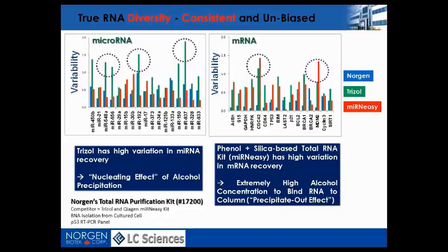The question is, is this suitable? Bear in mind that while these methods are good for certain types of samples, they still have some shortcomings, especially when dealing with samples with very low RNA inputs. One of these shortcomings, for example, is the loss of diversity, especially when extracting RNA using phenol-chloroform. In addition to the inhibitory effect that is present in the RNA extracted using phenol-chloroform on microarrays and sequencing, phenol-chloroform extraction procedures tend to have a bias in RNA recovery, particularly microRNA, based on the GC content, and therefore not all the microRNA profile will be identified. Some microRNA may be thought to be differentially expressed, but actually, due to this bias in the extraction method, they were not captured from the beginning.